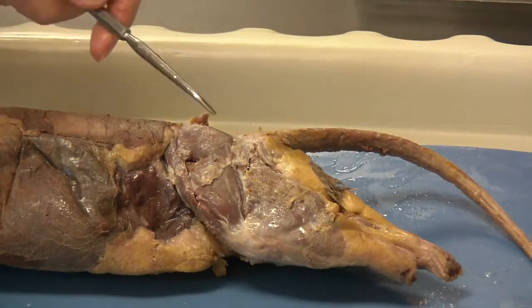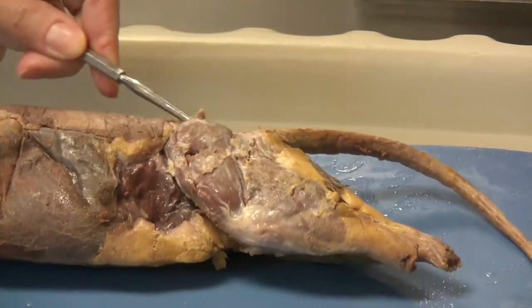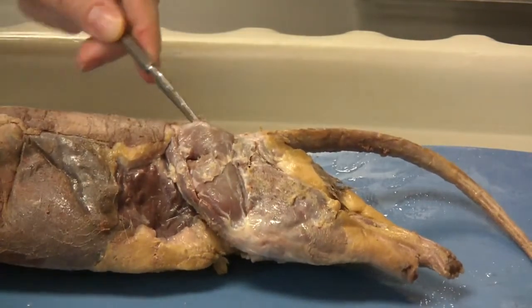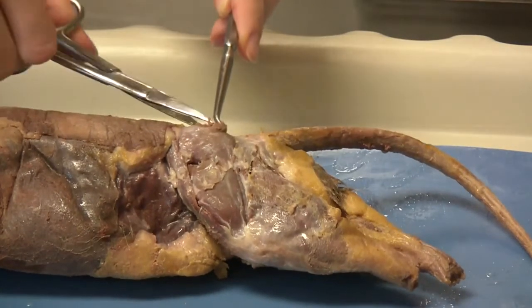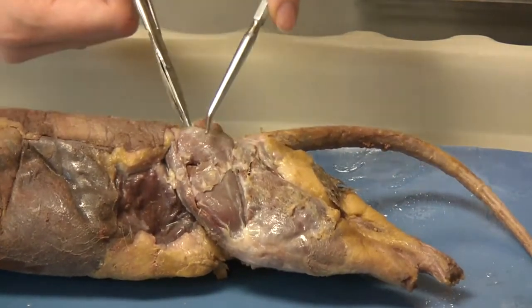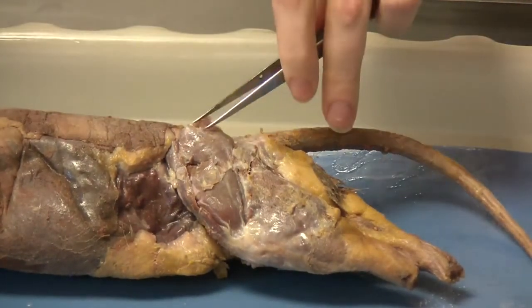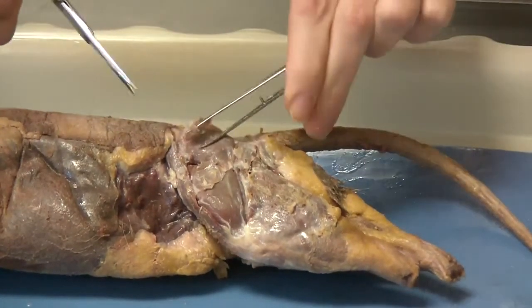Then you will use your blunt dissecting probe to go underneath this layer of musculature and loosen it. Then take your scissors and snip in a circular motion around the edges to remove the gluteus maximus completely. Pause to loosen as much as needed.